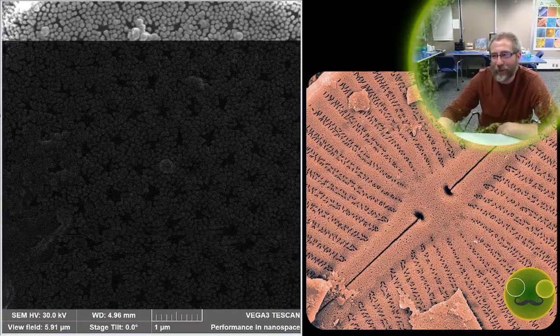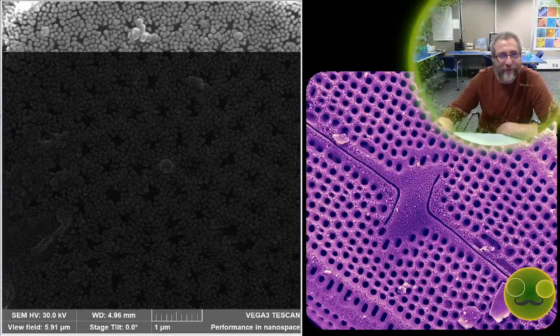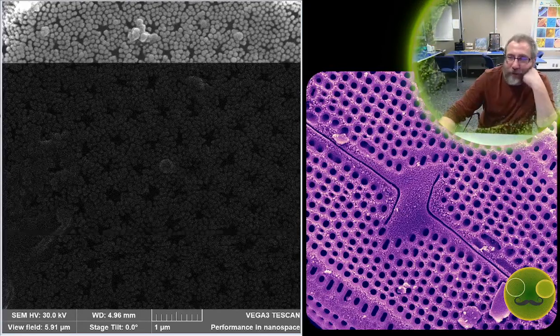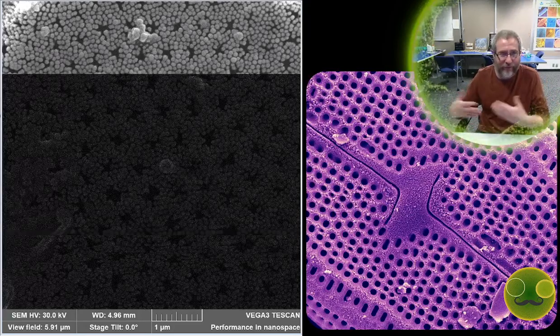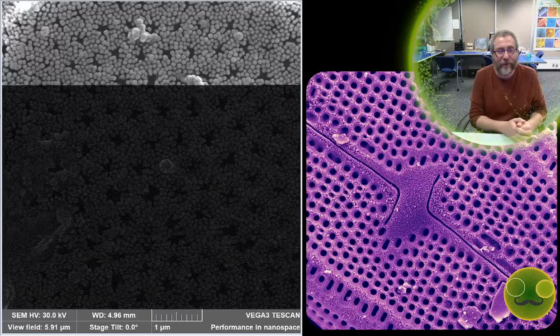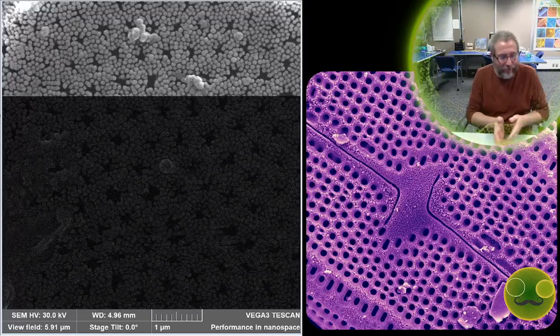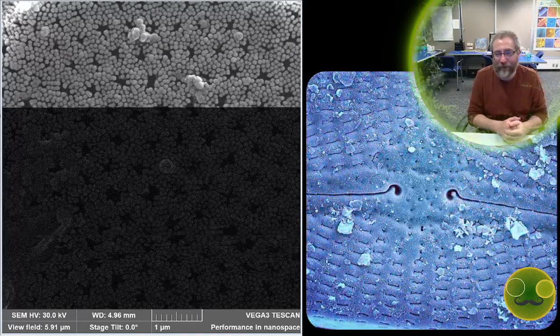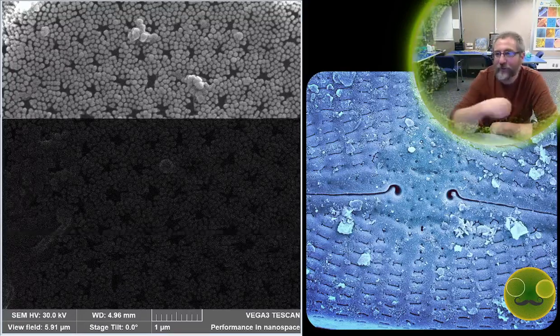What's in the SEM right now? We're looking at some cultured material. These strange little beasts that were captured by Andy Alverson's lab and then isolated, and then because diatoms can clone themselves, they just put them in these tanks where they have all the nutrients they could ever want, and they just go like, be yourself, make clones, and they do, and then the clones over time turn into sort of circus freaks.